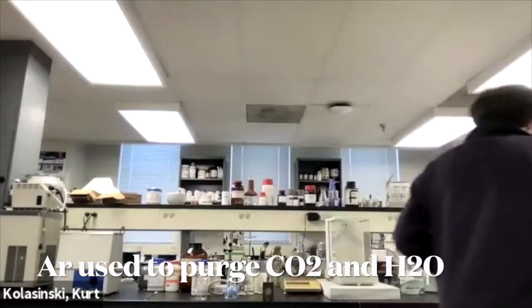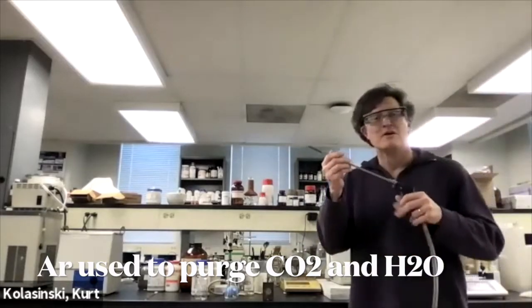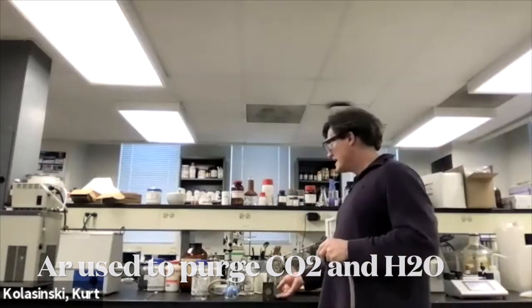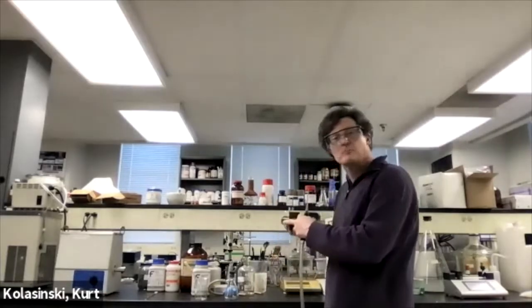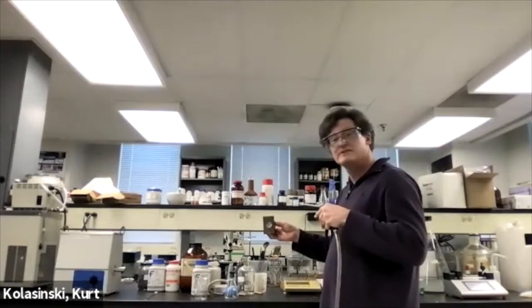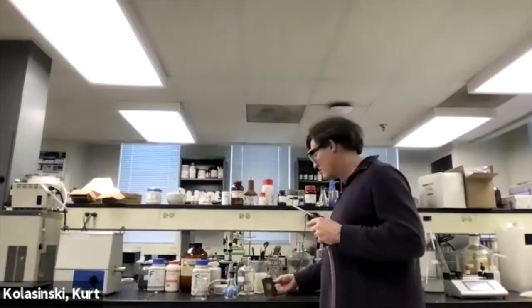So what are we going to use? We're going to use argon. So I've got a tank of argon hooked up here. And what we're going to do first of all is take our cell and purge it with argon, because the argon will get rid of the CO2 and the H2O, and then we can take a background spectrum with no interferences.